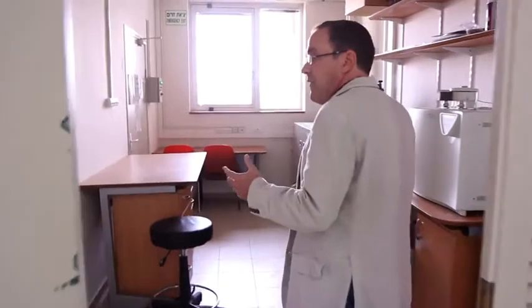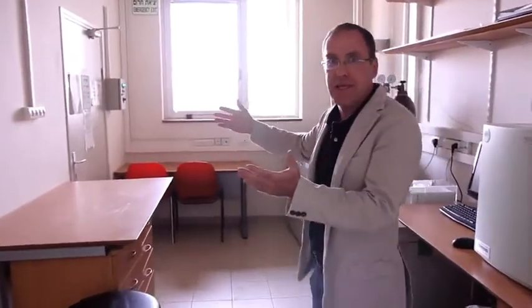Okay, so now we're in the Manna Center for Plant Biosciences. This is the area in our department where we grow all our plants under various conditions. All of these rooms have literally hundreds of different types of plants growing under various conditions. Let's take a look and see how we grow the Arabidopsis. So what we have here actually are two different rooms, and we'll see them in a second.